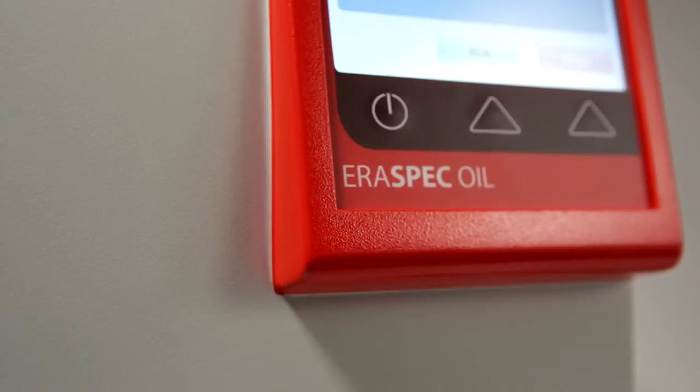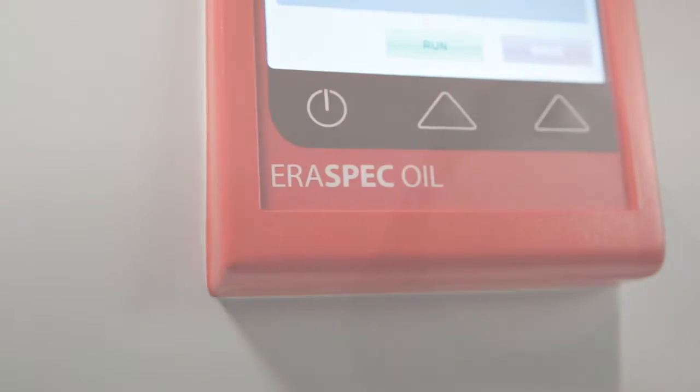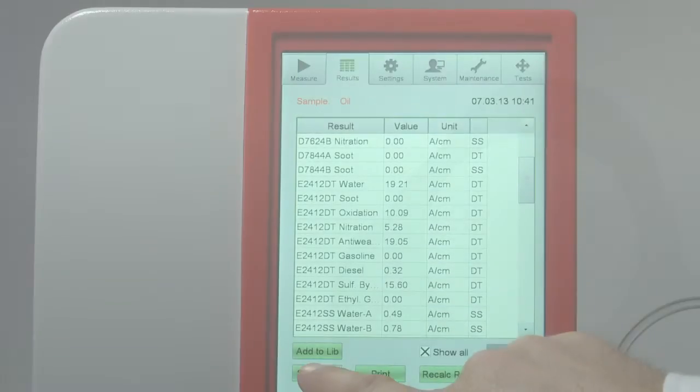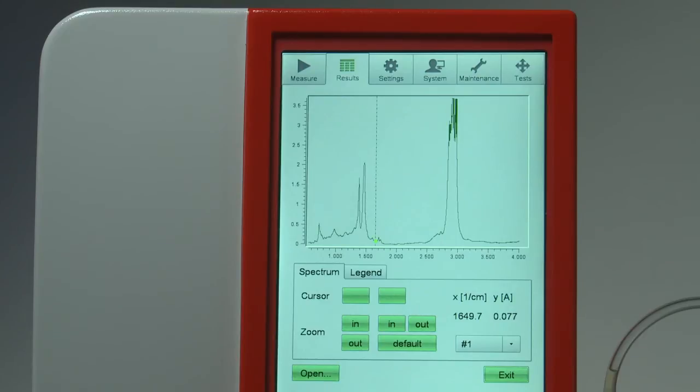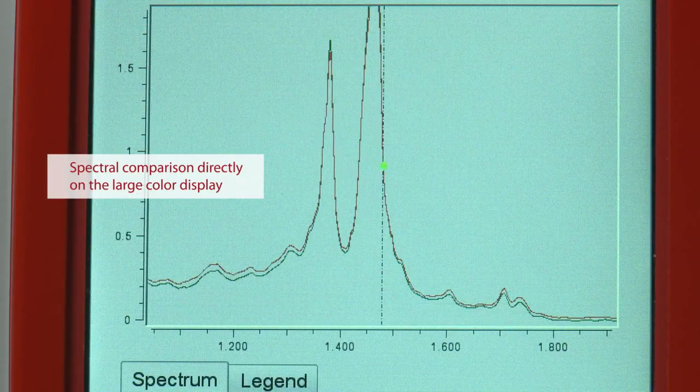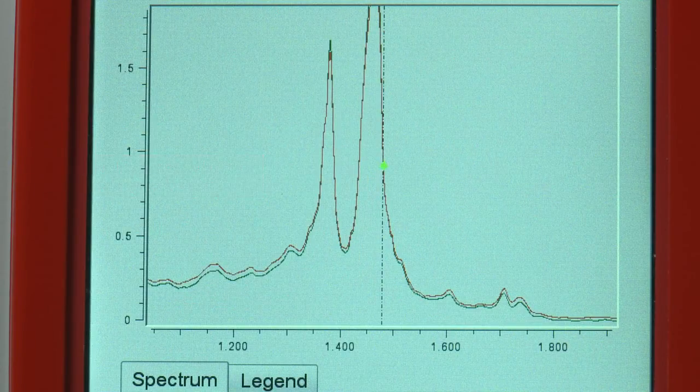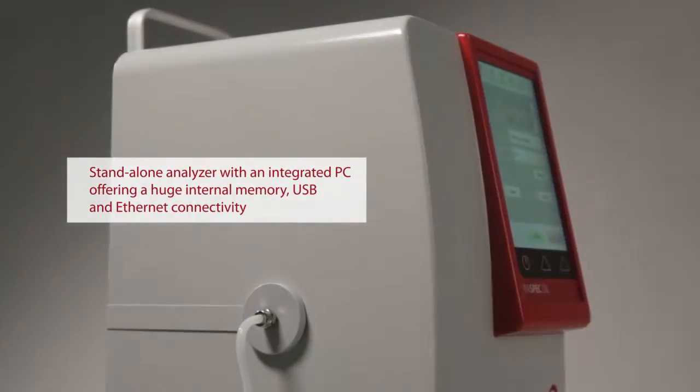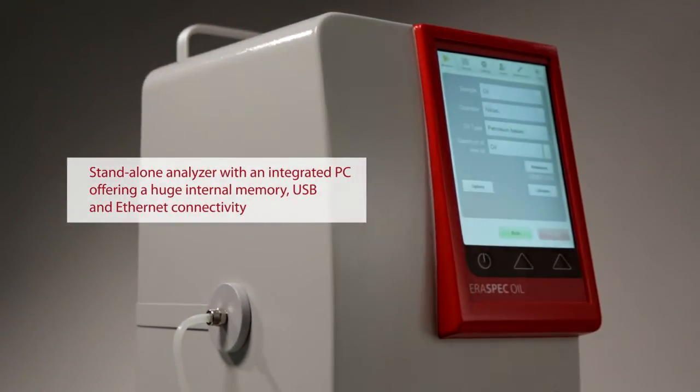For in-service oils, it determines the change in viscosity over time. All results are displayed on the large full-color touchscreen. Different oil spectra can be directly compared on screen, with internal memory holding several thousand measurements. There is no need for a computer in the field.